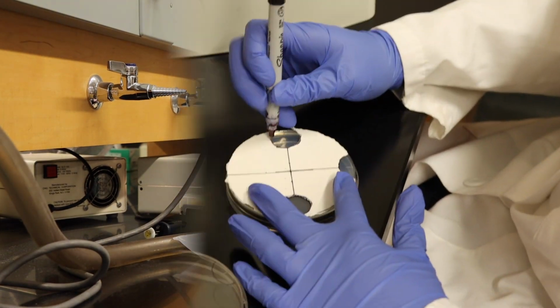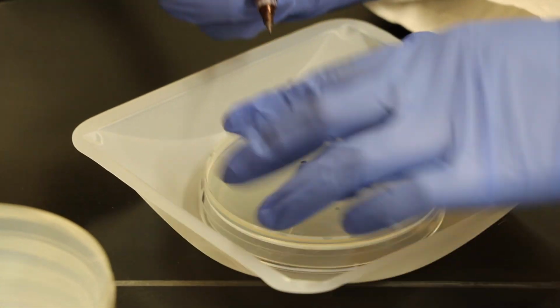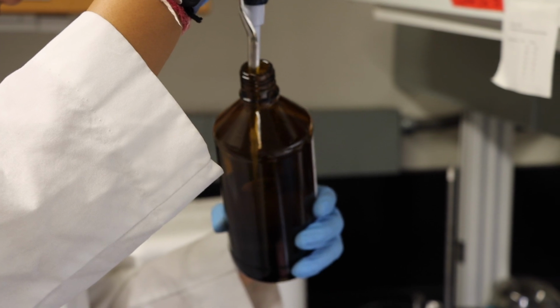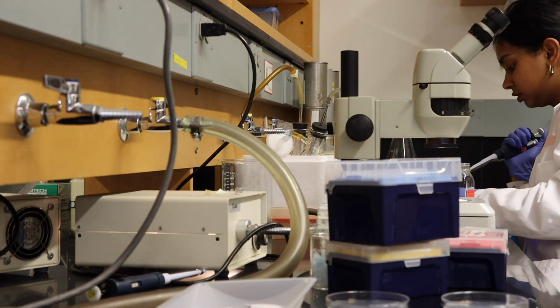Before the assay begins, we mark the assay plates with circles on either side of the plate with a 2 cm diameter. The sodium azide and different odors will be placed into these circles respectively. Additionally, the 1:10 dilution of isoamyl alcohol in ethanol is created every time before the start of the assay. This assay is split into 4 parts. The first part is the experimental assay.